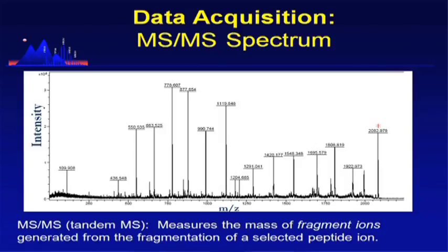So it's the same idea that we can predict the tryptic peptides. Now we have a fingerprint because we know where they should fragment when we digest with trypsin. So now we have a fingerprint of peptides for that protein. It's the same with our fragmentation in the mass spec. We have a peptide, we know where it should fragment, and now we experimentally have a fragmentation pattern, so we can predict and we can match them up.